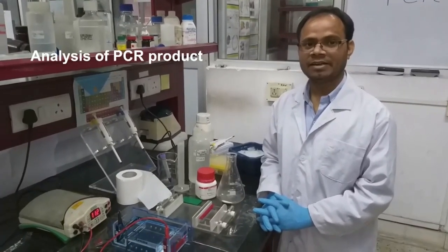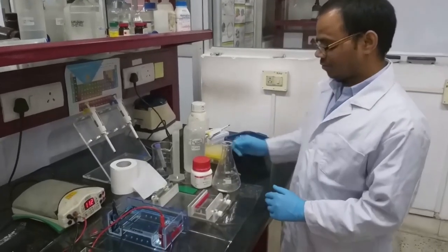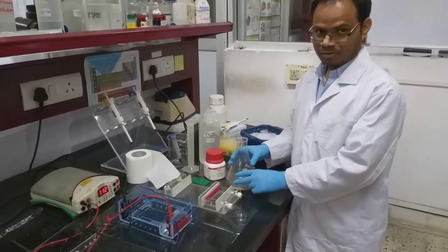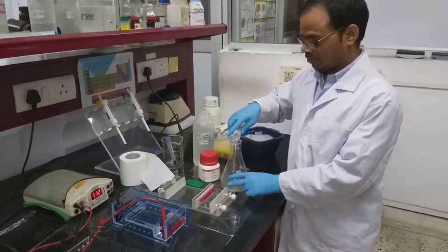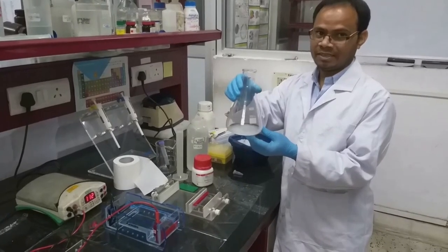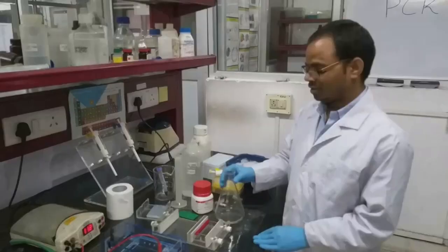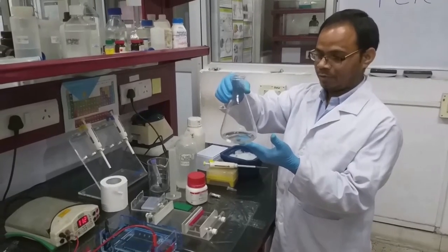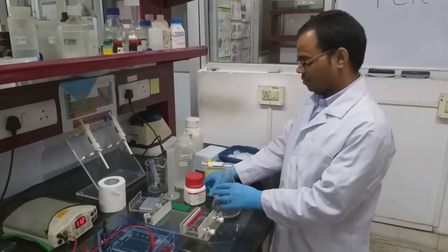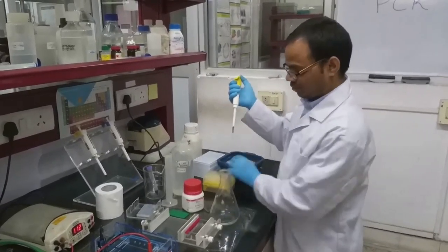Once the PCR reaction is completed, we have to analyze the results for amplification. For that, we need agarose and TAE buffer. First, we have to weigh agarose and mix with the TAE buffer. It will not dissolve easily, so we have to heat it in a microwave oven until it dissolves. Now, agarose has dissolved in TAE buffer. We have to let it cool down to 50 degrees Celsius. Now, before pouring, we have to add ethidium bromide for detection purposes.